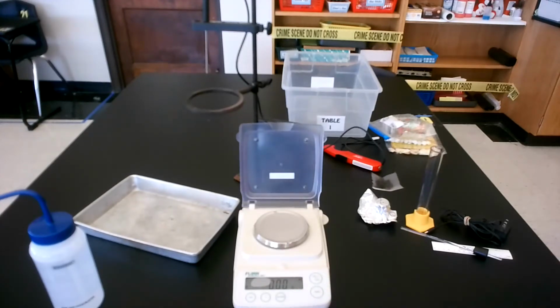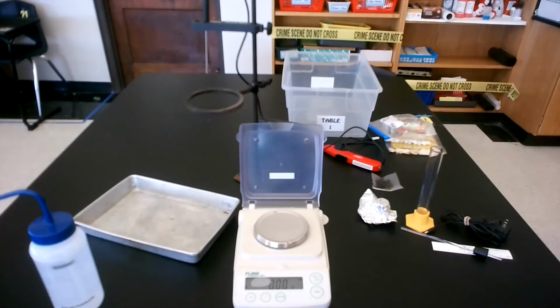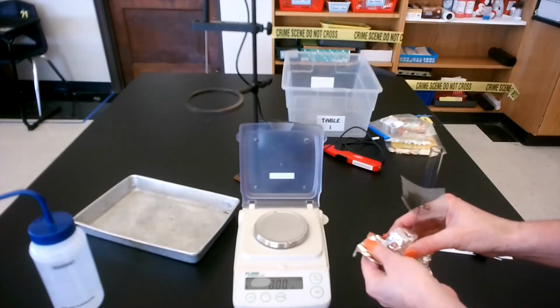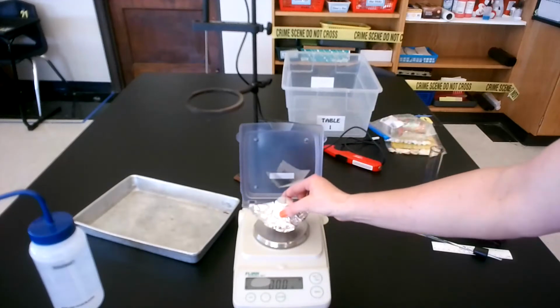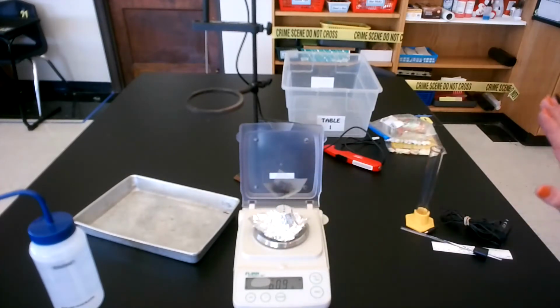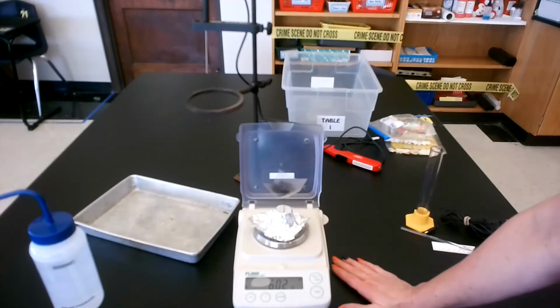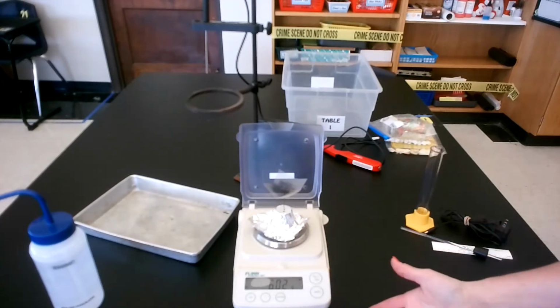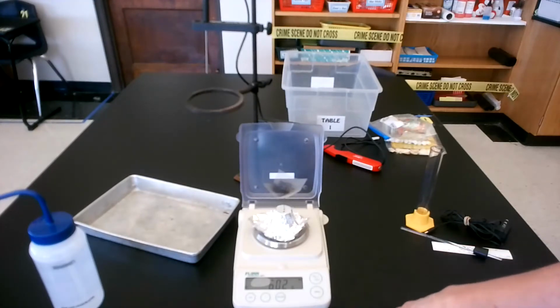So what I need to do, if you go to your OneNote, the pre-lab, for each food sample, you're going to be finding the mass before and after burning. So first thing we need to do is we've constructed our food holder. We're going to find the mass of the food holder by itself. This balance is very sensitive, so if you're bumping the table or hitting it, it could change. So just make sure everyone backs off, and then you're going to record.